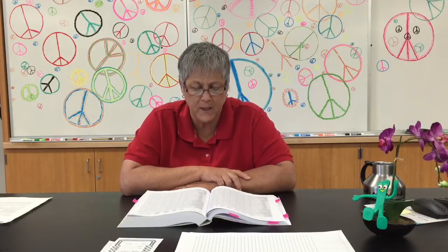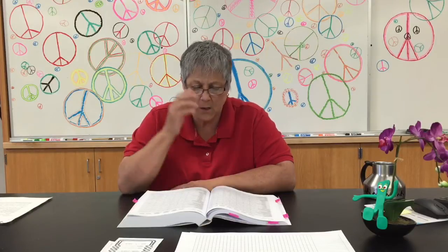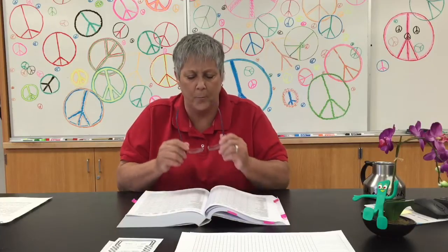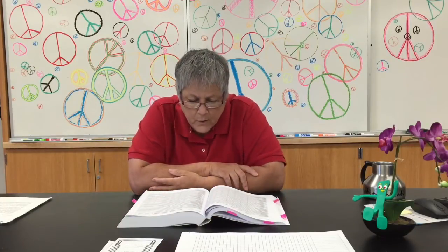Now, take a look at the next several entries, fermentation of carbohydrates, beginning with D-glucose, and that's the glucose that we used. Now, the only one that's broken into an acid line and a gas line is glucose. So acid means, did the broth change from red to yellow? That's the reaction we're interested in. That's the line that you want to use in Bergey's manual if you do need to use the glucose fermentation test. The gas line would mean was any carbon dioxide gas captured in the Durham tube. Highly variable. Don't use it. It isn't going to help you. All right, so D-glucose, that's the glucose we used.